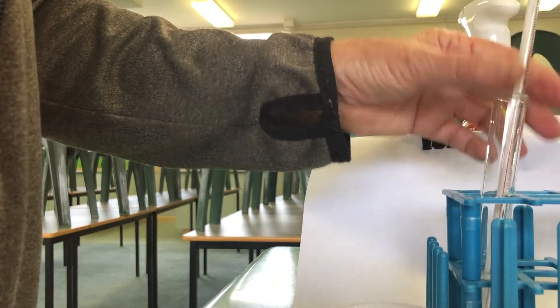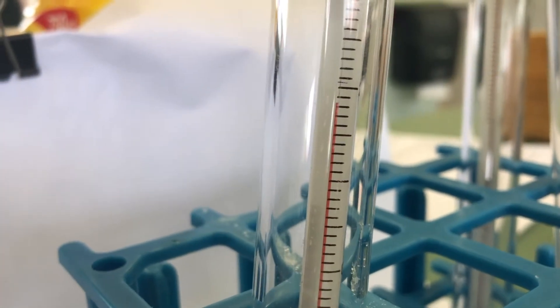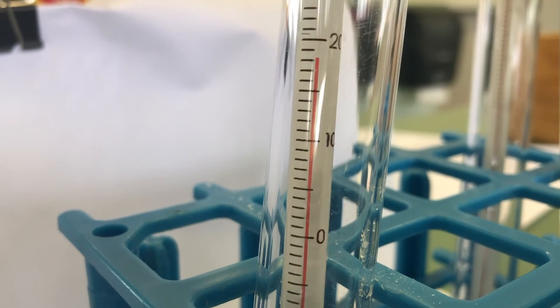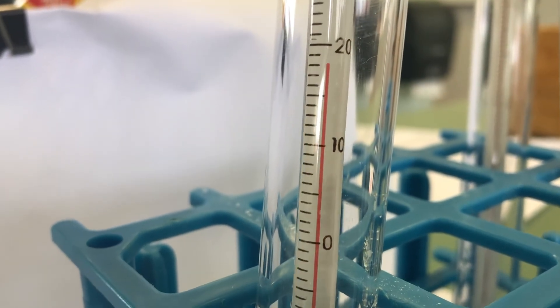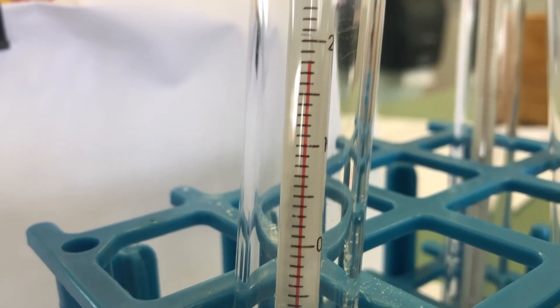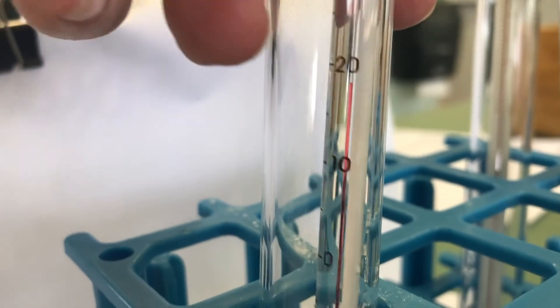Let's see what our temperature is. Okay, so it was 20 — we can see it might be going down a little bit, not too much, so it's gone from 20 to 18. We'll keep an eye on this one as we go and see if it gets any hotter or colder.